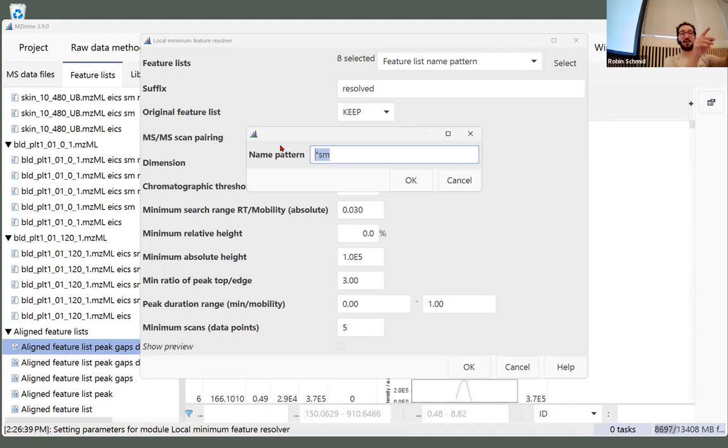In this way, you can also use that in batch mode. In batch mode, you could set up different thresholds, and you could even split it into 2 different processing steps, like low filtering and high filtering, let's say, and process it twice. Then you just use * as a wildcard, so you allow everything, and then SM.